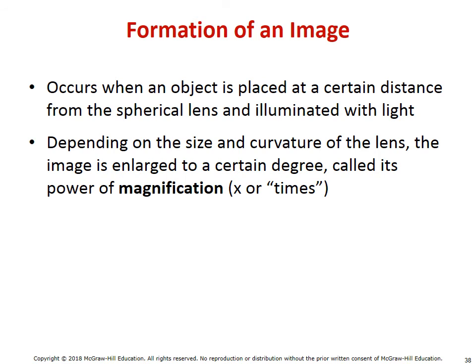So I do want to point out that the image of what you see can be enlarged, and so we need a way to measure the degree of enlargement, and the word that we use here is magnification, or times, or x. So our measurement for enlargement is magnification, and we use units like x or times to describe that.